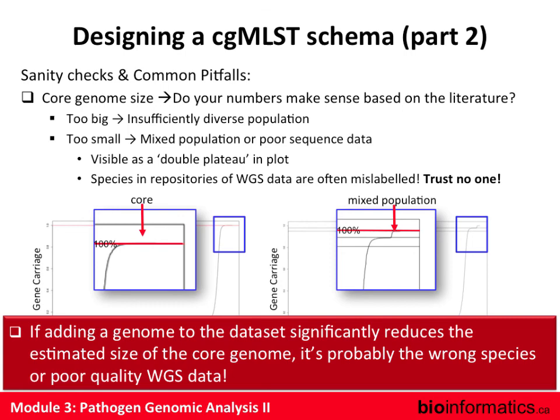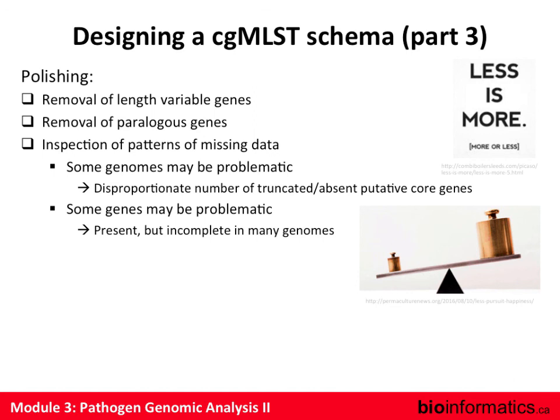It's not like fish, when you say, oh yeah, this is Chilean bass, and it totally isn't because the restaurant is trying to scam you. People mean well. It's just that sometimes, when you're submitting hundreds of genomes, errors happen. Actually, genome sequencing is one of the best ways to detect that. True enough. So certainly, just be skeptical, and definitely there's going to be a lot of polishing required.